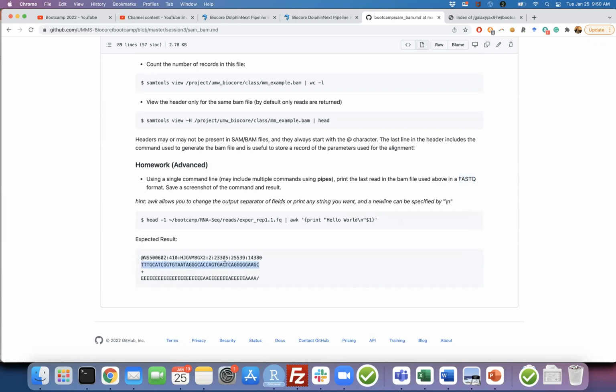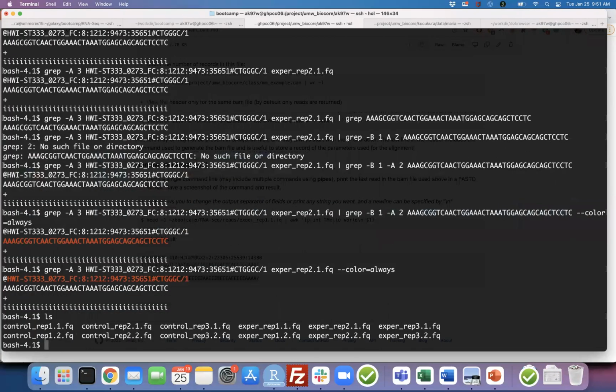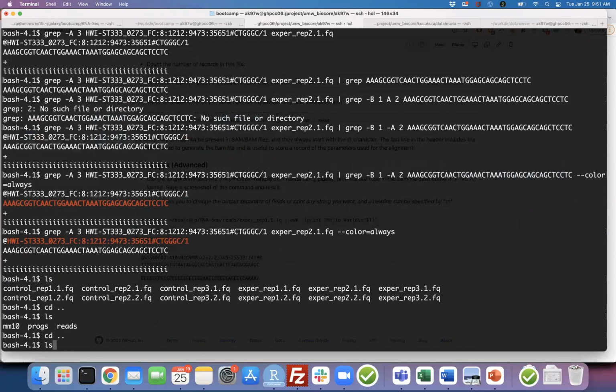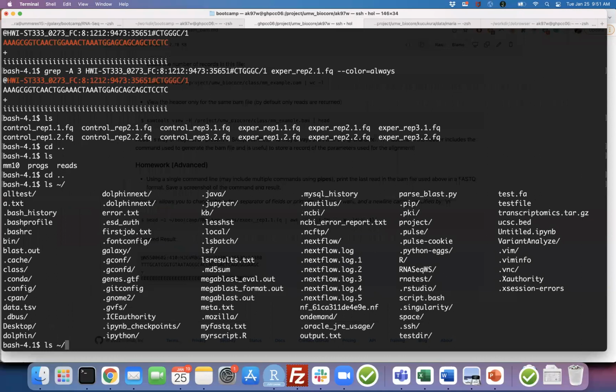So we know where the read name is, in which column, and the read itself. We're going to put a plus sign and then the quality information from the alignment file. So I need to find a BAM file. I'm just going to find something, for example, where I had maybe, so I'm going to go to that location, the biocore.